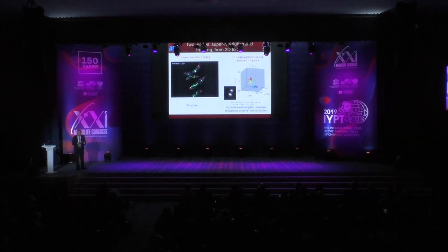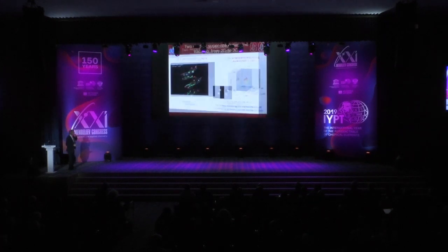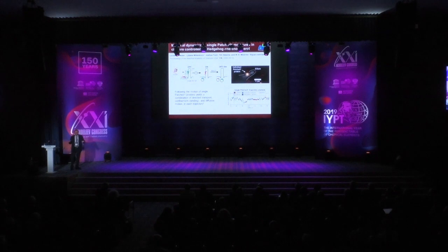And that kind of motion, of course, tells you about what's going on in the cell. Let me emphasize that a little bit more. If I can watch the single molecule move, then I will learn the science by just simply following its motion, measuring its motion, and understanding its motion. So here's one of many examples of this idea. A little bit more biology.